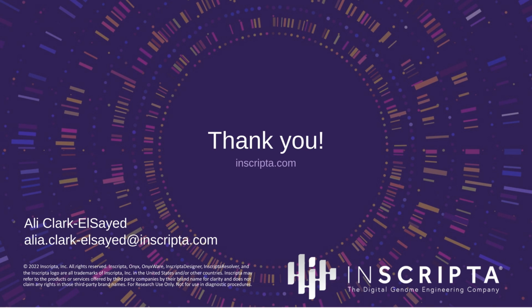Great presentation. Why does resveratrol being derived from Coumaric acid result in it serving as a good control? Also, would you recommend the Onyx system for studies of larger molecules? So we were thinking that you're able to use the Coumaric acid and resveratrol as controls for one another, just because they are of a similar size and relatively similar chemical composition.